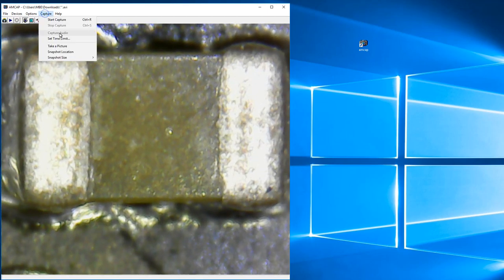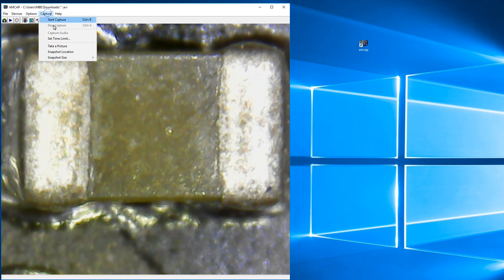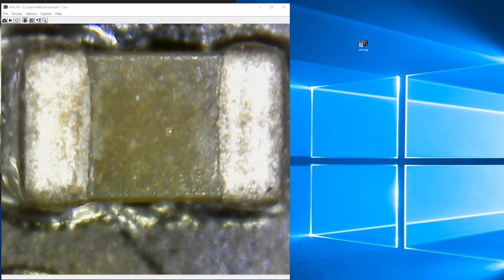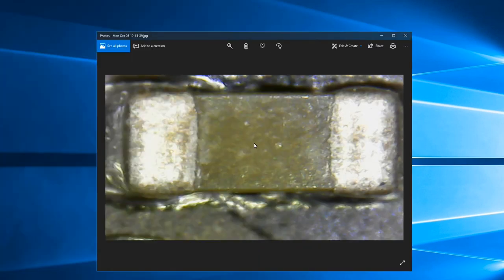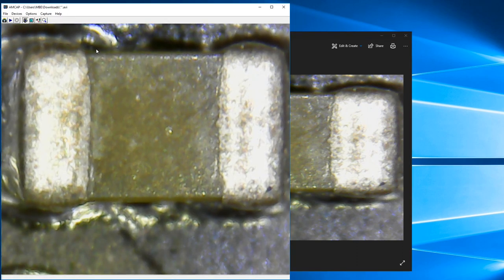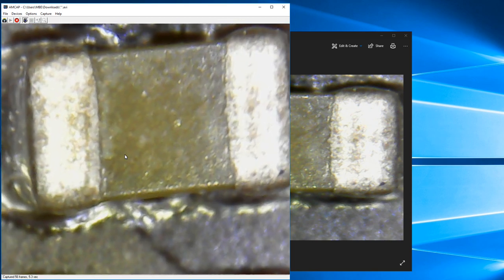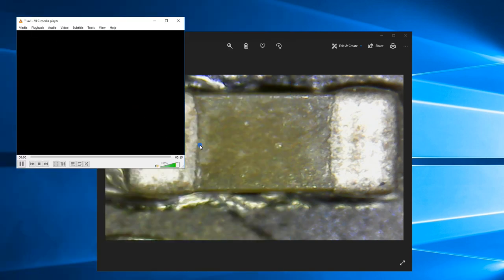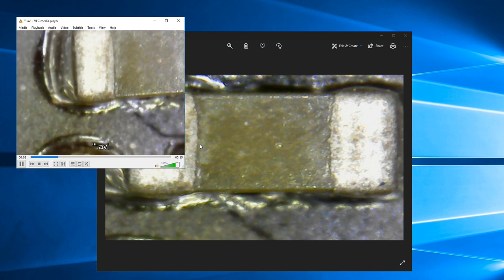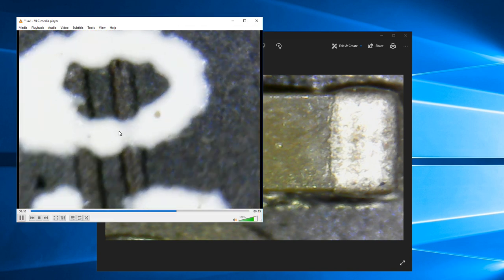You can capture at different resolutions — we can go to higher resolution and take a picture. Now right over here we have a captured picture. If you've got a bug or whatever, you take the picture. To record, we go to 'Start Capture' and then 'Stop Capture' — and now it captures what I'm recording. We've got the video saved now and we can play it back. So now you can view and record anything — bugs, specimens, whatever you like. Nice little device to bring to school.